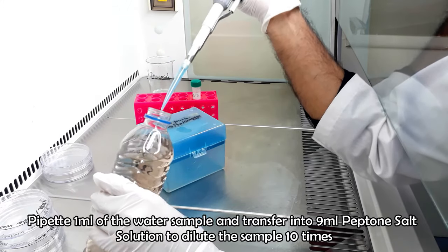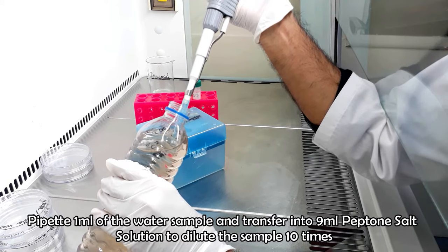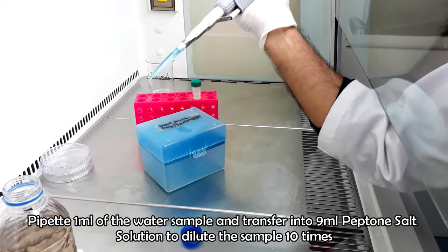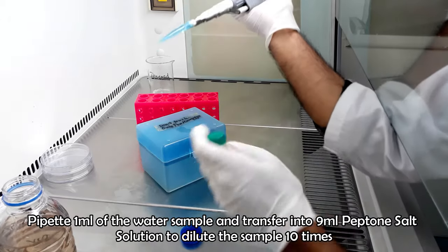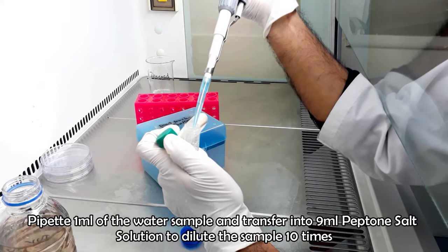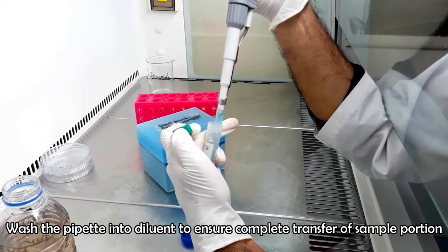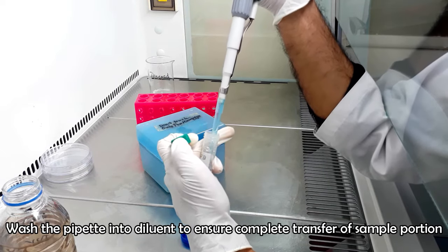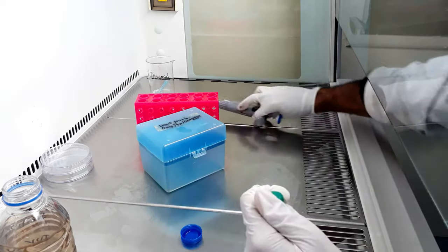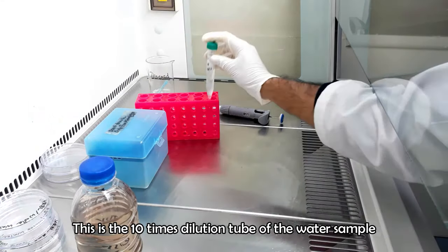We are transferring 1 ml sample into 9 ml diluent to dilute the sample 10 times. You can make further dilutions if you think that your sample contains a higher load of coliform bacteria. The sample is ready for inoculation.